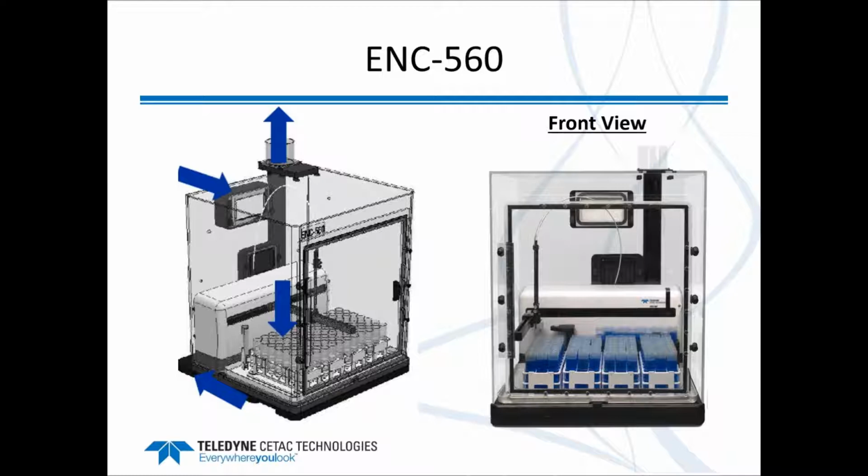The way this works is that there are holes cut in the base of the autosampler, which allow movement of the air through the HEPA filter in the back, over the samples, and then out through channels cut in the base of the enclosure through the vent.